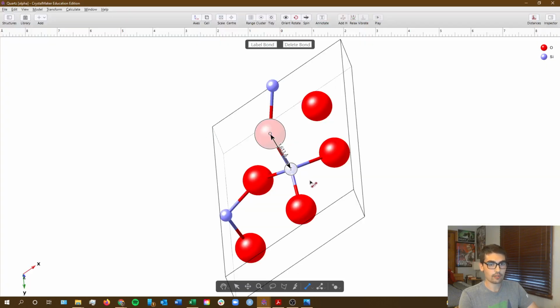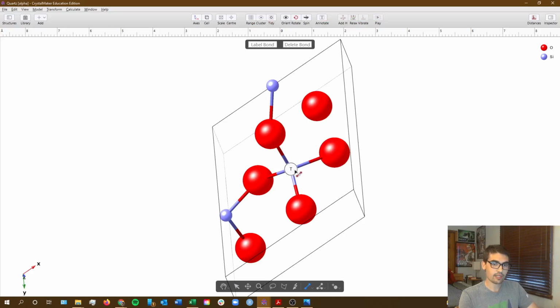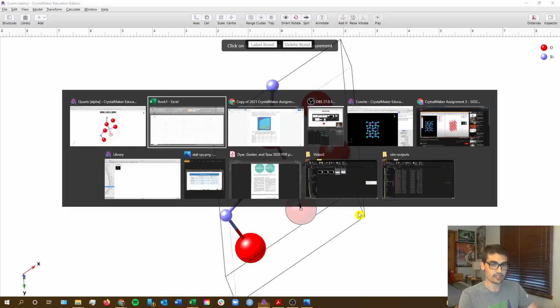Great. Go to the right, 1.605, a little different, 1.605, and the fourth one down is 1.605.